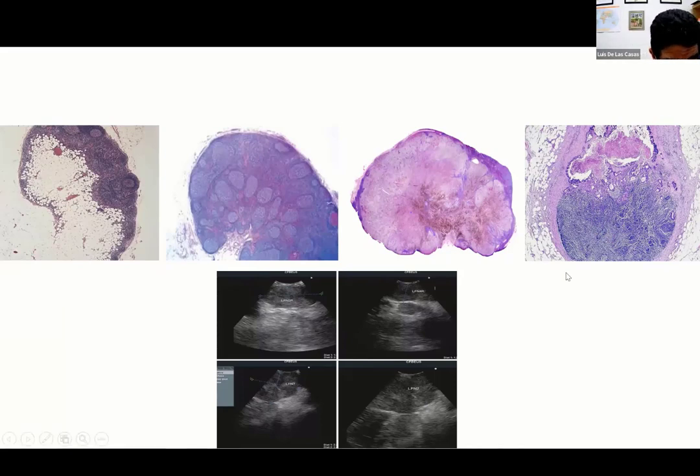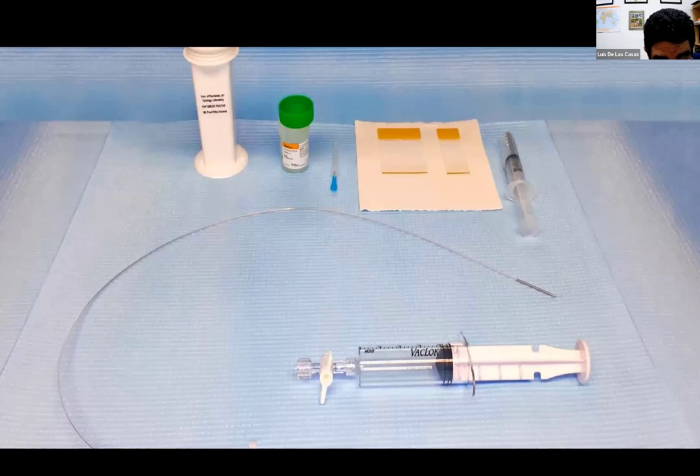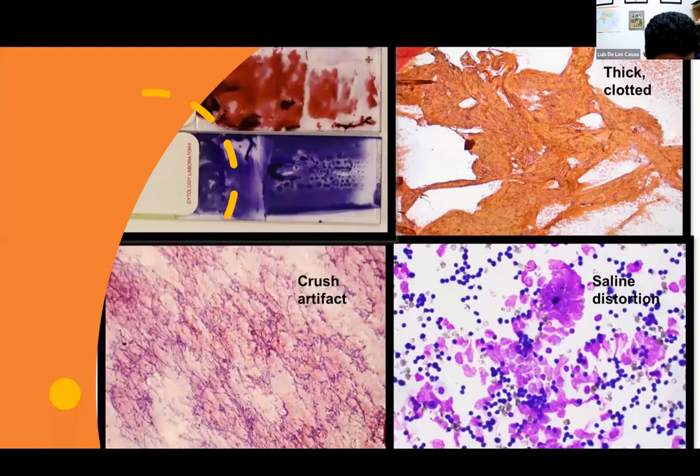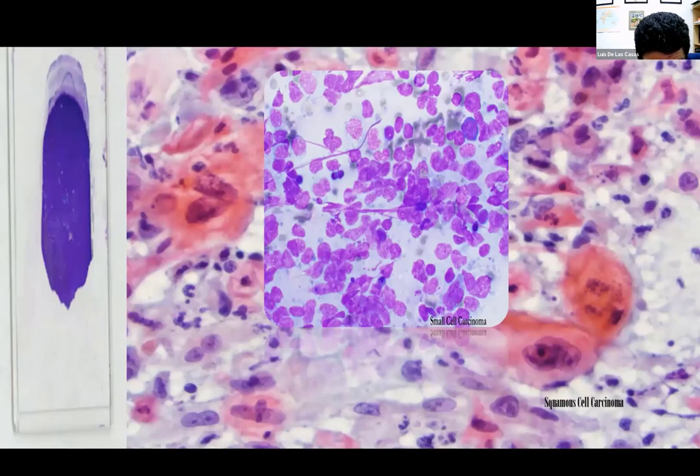Another consideration is that it is good practice to have ample space on the table where material is divided and smears are made. This is very important. Only what is needed for each pass should be on the table. Once the process is in place, it is imperative to monitor the various steps for new noise or biases by scheduling periodic meetings as well as collecting metrics for validation. Bad preparations can preclude adequate interpretations, as everybody knows. Next slide. And good preparations made after a good pass and good smearing technique can make a difference.